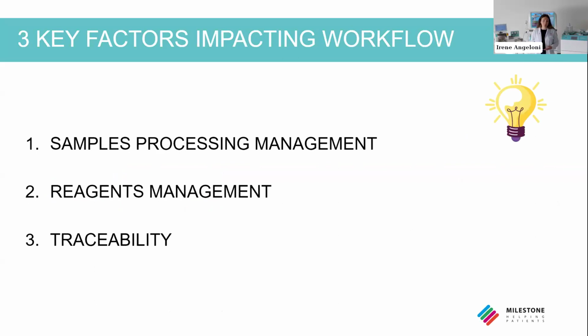Today, during this webinar, I would like to discuss with you these elements in 3 different steps with 3 different key factors that have an impact on the workflow, to better manage the whole workflow of the lab. These key factors are the samples processing management, the reagents management, and traceability.